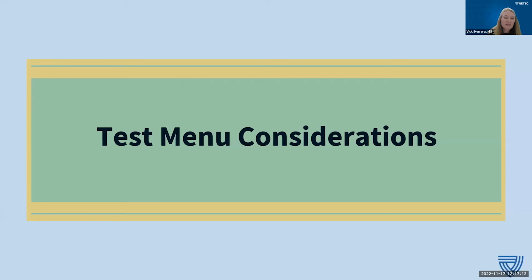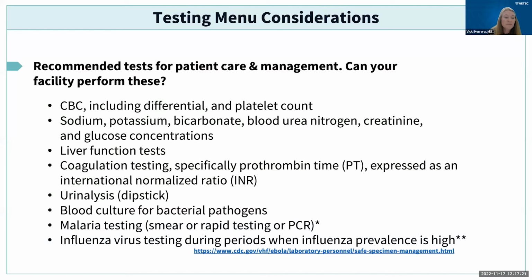So what are some test menu considerations? Let's say that you do have to care for that patient longer than that, and they do require some laboratory tests. These are currently the recommended tests for patient care and management of an Ebola patient. But can your facility really perform these tests?